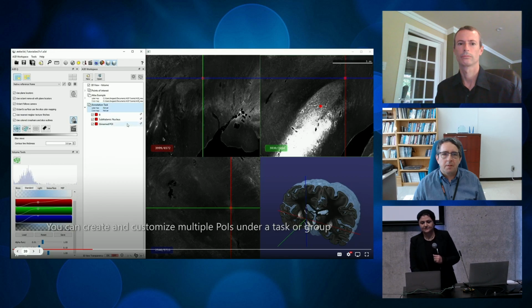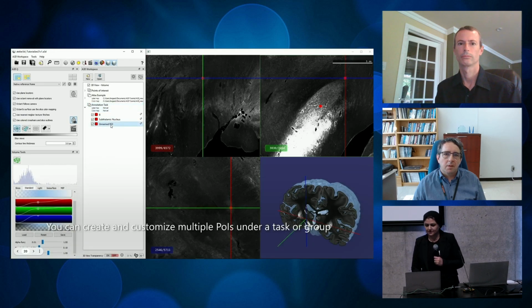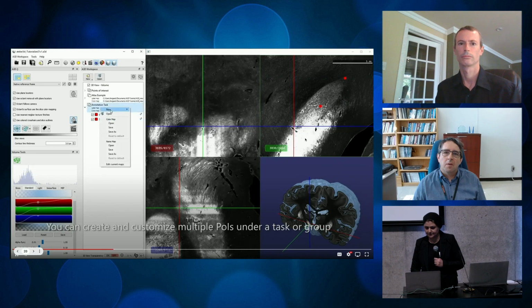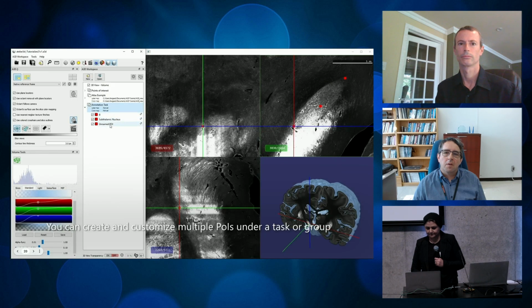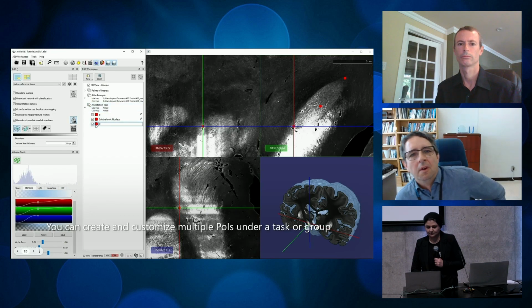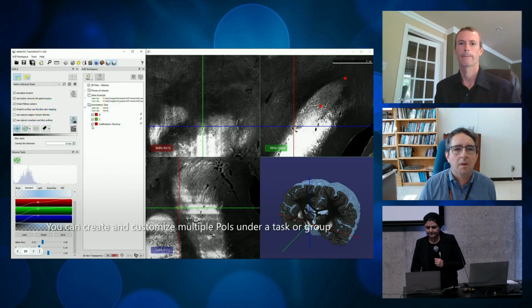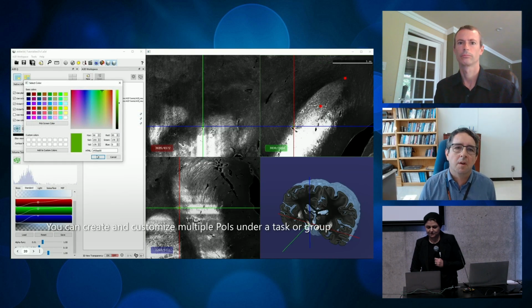And we can create lines. The lines are created by connecting two or more points. For example, here we choose two points and change their name, and even change the colors.